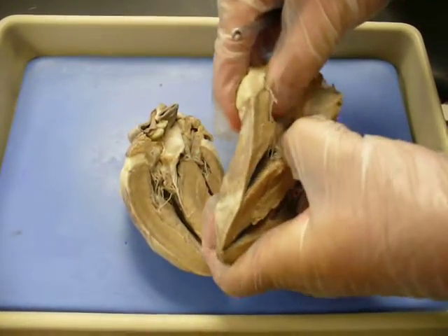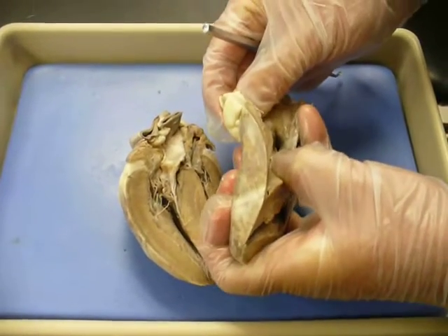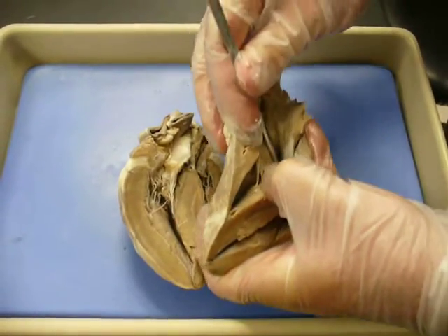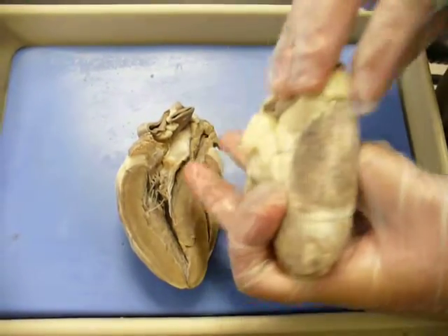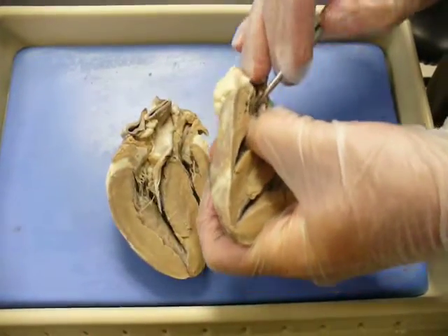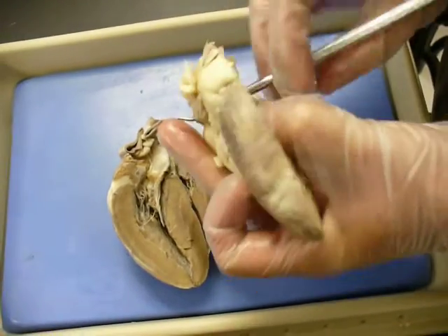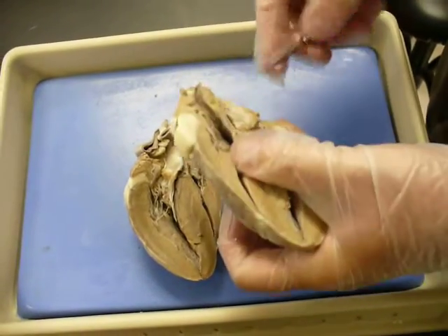If you go inside the atria, you'll see two holes. The lower one, right down here, is actually the opening to the coronary sinus — you can see it right through here in the back. And the one up on top is actually the inferior vena cava. So you have those two openings there.